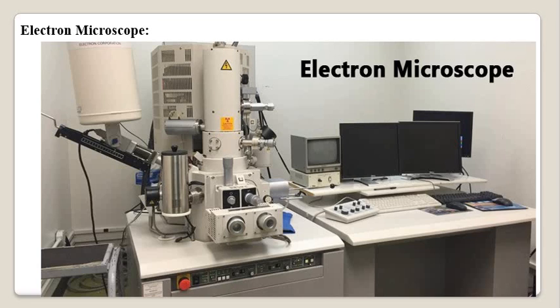Now this electron microscope is commonly called EM, right? The electron microscope is an optical instrument which utilizes electrons as a source of illumination for observing very minute objects with great magnification. So it utilizes electrons for observation of very minute objects, right? So light is not used as a source of illumination.